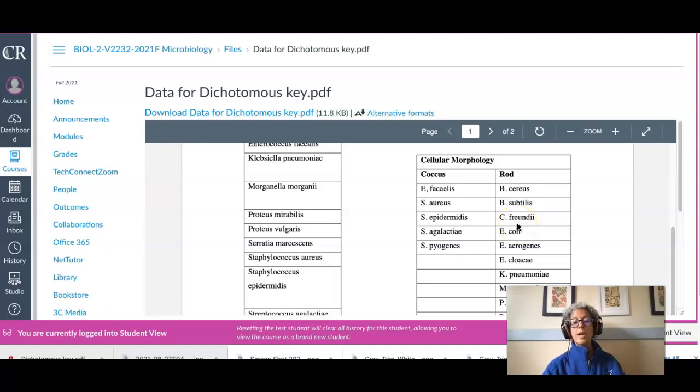You must keep that in mind throughout this process, that positive and negative are all independent answers for each test. Any organism can be positive for one test and negative for all the others, negative for the first test, positive for some, negative for others. Each test is independent.